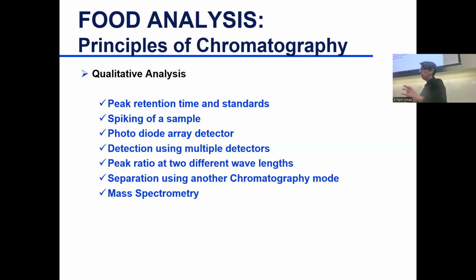Photodiode array detector, we'll talk about it when we cover spectroscopy, but some of you also saw it in lab. It allows you to give a fingerprint of a compound, an absorption fingerprint, a spectra. So the spectra is unique most of the cases to this compound. So here you have wavelength, call it lambda.